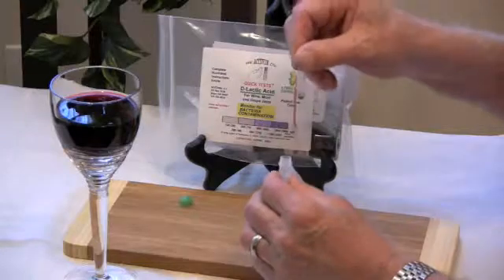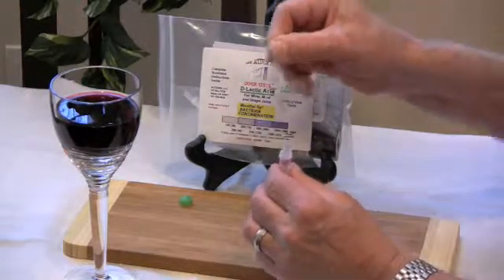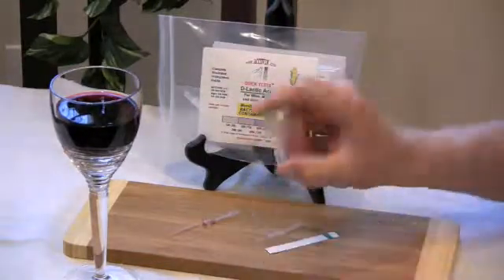Remove the green cap, put the tip into the diluent, squeeze once, and remove it before releasing the bulb. Replace the green cap and shake.